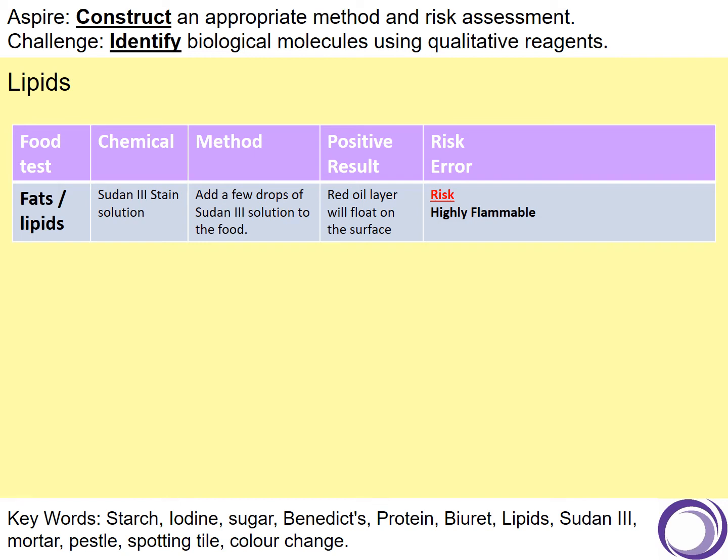The other one that you can do, I've shown you on the video next, is you can just add ethanol to the solution, shake it, and if it goes cloudy, it's got lipids in. So there are two for this one. You can use either one for AQA.